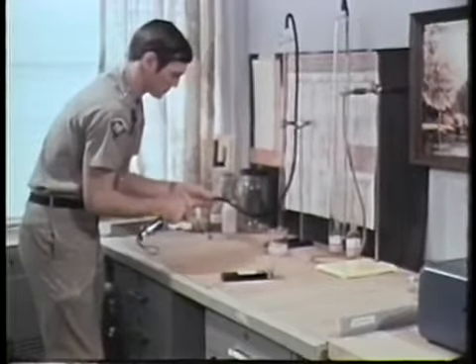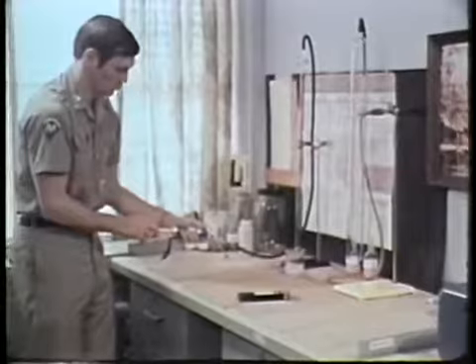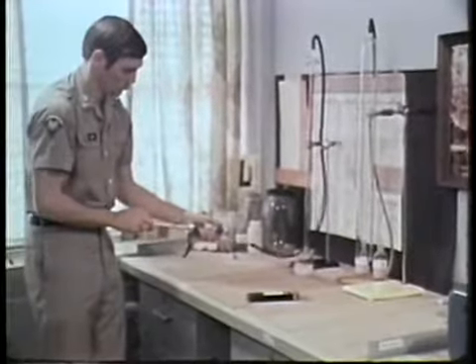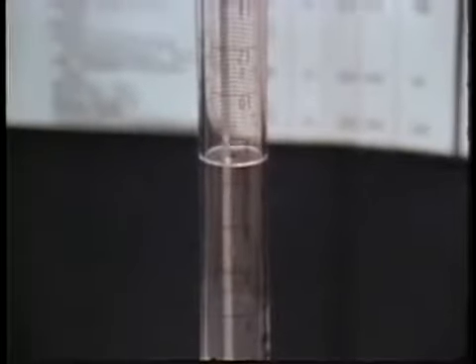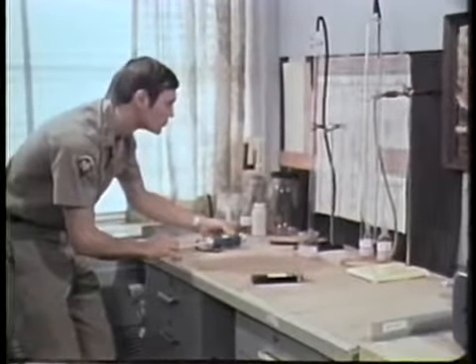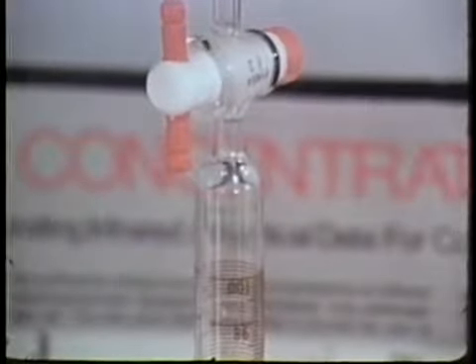Connect the burette to the pump assembly and pull a full stroke on the handle. The distance that the soap bubble travels through the burette indicates the volume of the pump. The volume should be 100 milliliters.